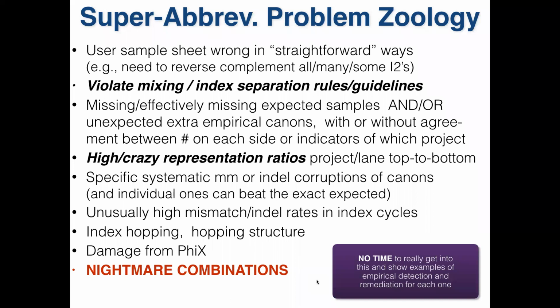Sometimes what trips people up, though, is that there are mixed components that they're not expecting. So when we were selecting phi x, this is why. Phi x has poly G on the front, I1, and it has this particular sequence for I2. If you don't check against that sequence when you're doing your distance checks, that guy can land close to you. That includes the poly G, because some kits include indices that are like 6 out of 8 bases G. I wouldn't have done that, but they're out there. And that means it will always be a two mismatch out of phi.